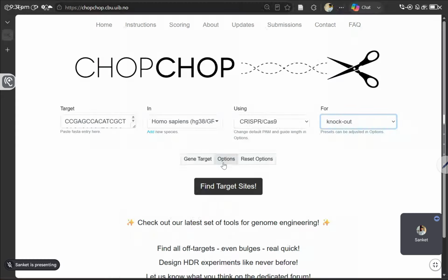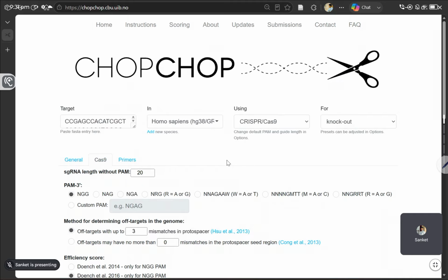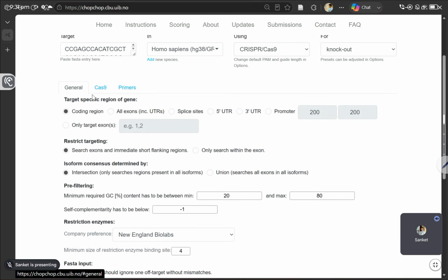Okay. Next, there is something called options here. Everybody can see there is something called options. Click on options. You have multiple settings available here. Don't get scared when you see these settings. After today's class you will get some idea, and based on that you can go and toggle what these other functions are for and how they work. You can try it on your own. It will be very interesting.